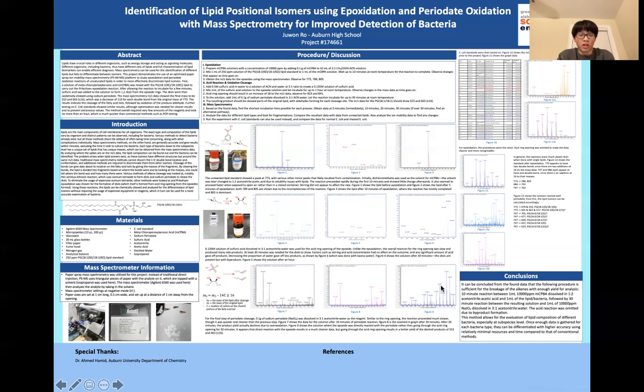These two were reacted directly with the epoxide, and as you can see, it is much cleaner. There are many peaks, but they're all from the same product, so it's better. I got the desired products, which were 553 plus minus 16 and 663 plus minus 16, which represents a cleavage of 2 and 1 of the fatty acid chains each.